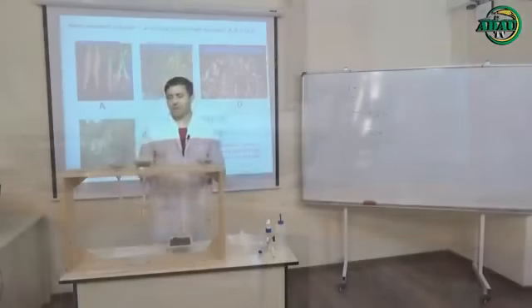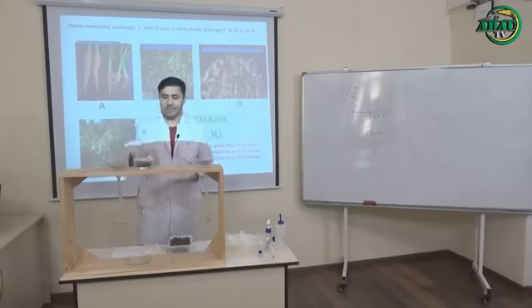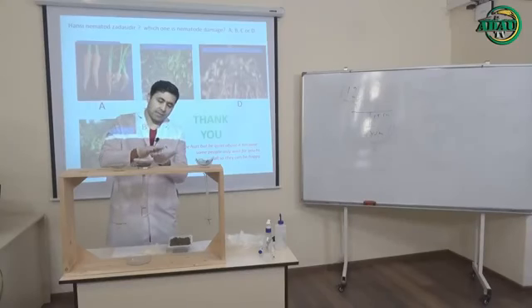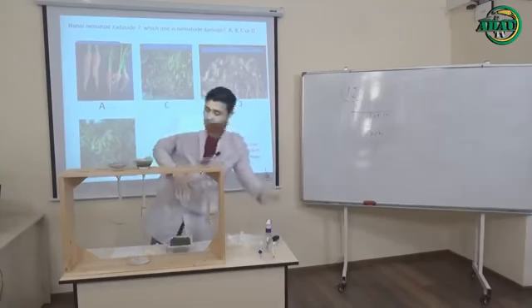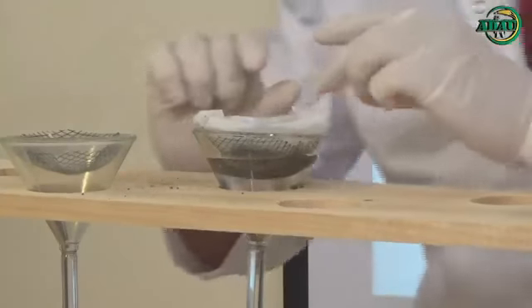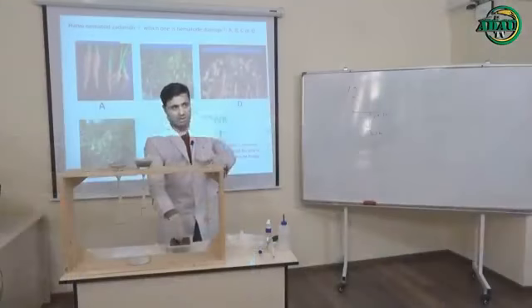But here, I would like to tell you one main point. Sometimes the soil takes up water, and you can see a distance between the soil and the water. That's why you should take water and add it here again. You have to make a connection between the water and the soil. It's important. Without this, the nematodes can go to the downside.